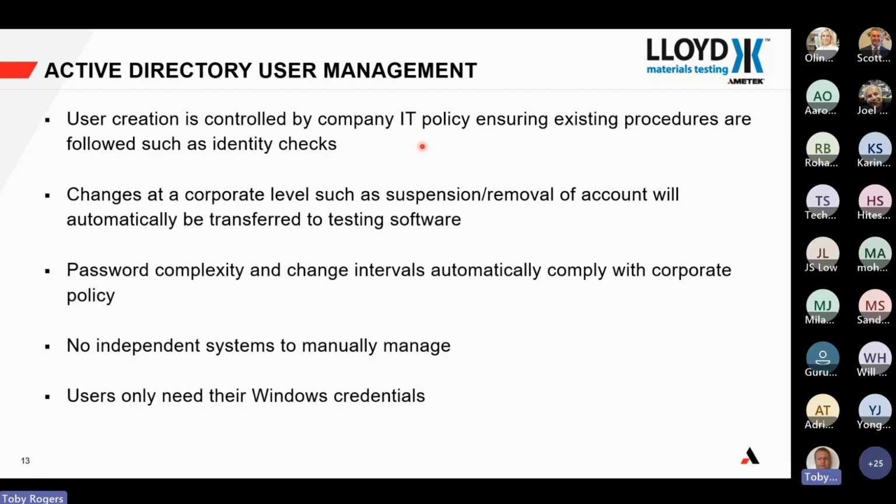So any existing procedures you have, such as onboarding new employees where you check their identity, that's all been done. And it also means that if there are any changes to employees, so if an employee leaves and they're removed from Windows, they're automatically removed from the laboratory software.